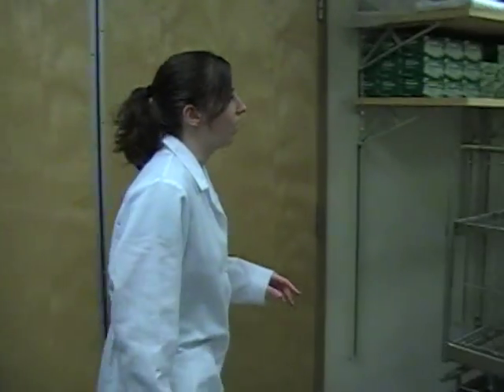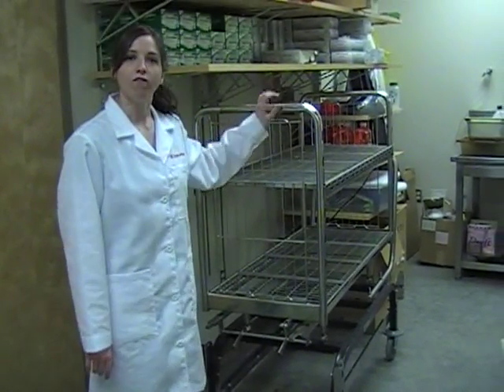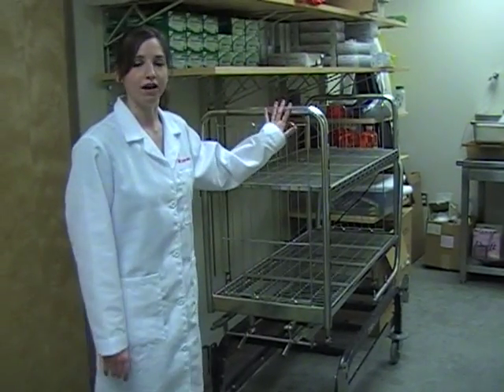In order to run the autoclave, we're going to use the autoclave cart. Be careful touching the metal because you don't know if somebody autoclaved before you in the last hour and it could be hot.